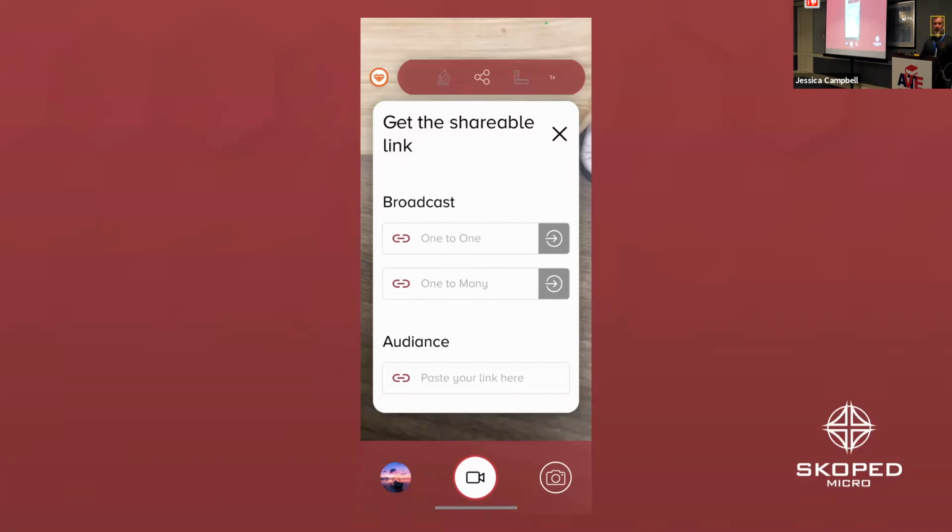Are you still looking through the app? Okay, I'm taking this off. So let's say I wanted to come in here and show there's a demodectic mite literally right in the middle. So you could line them up right in the middle and say, that one right there is what we're looking at. I don't have a pointer, but that's a really good idea. If I could draw on there, I could draw you a circle around it. That'd be very helpful. Gary, you taking notes in the back by any chance? All right, good.